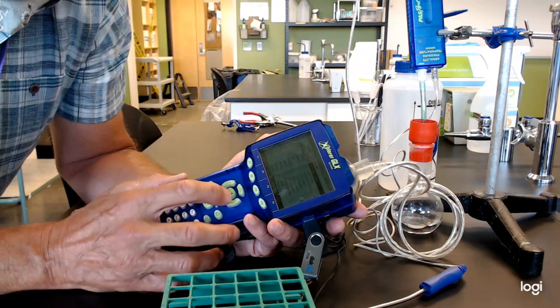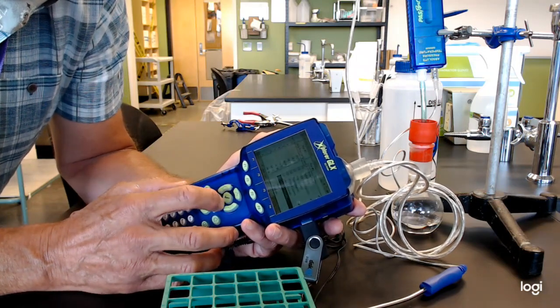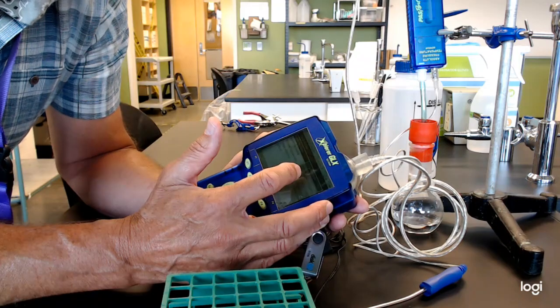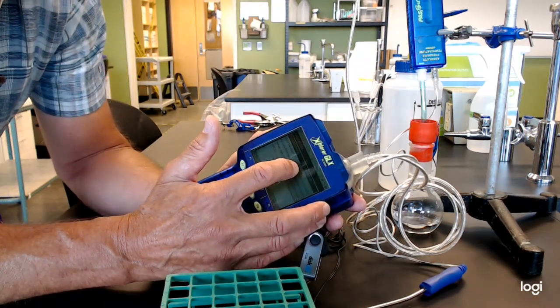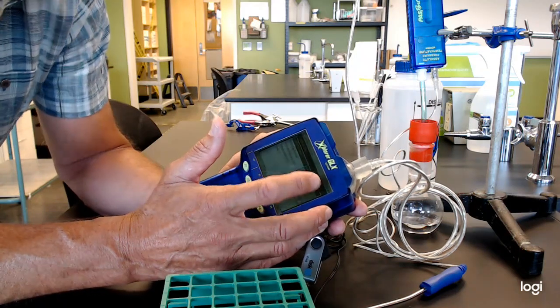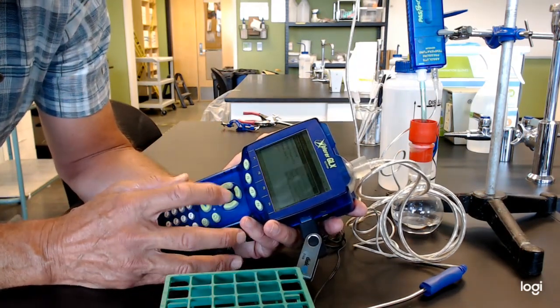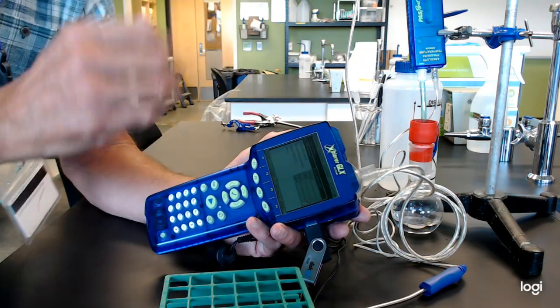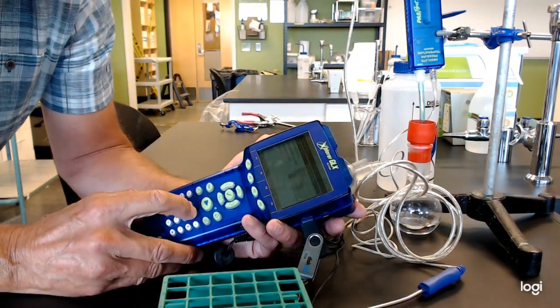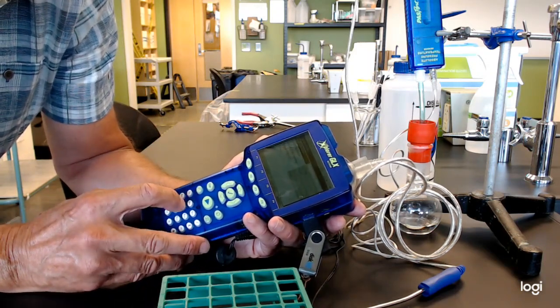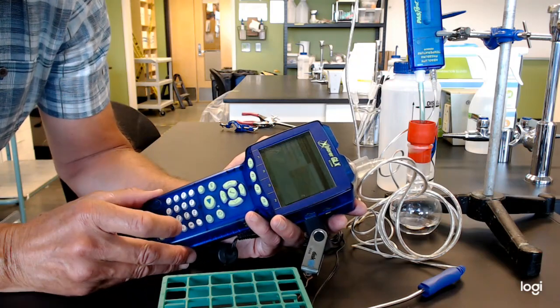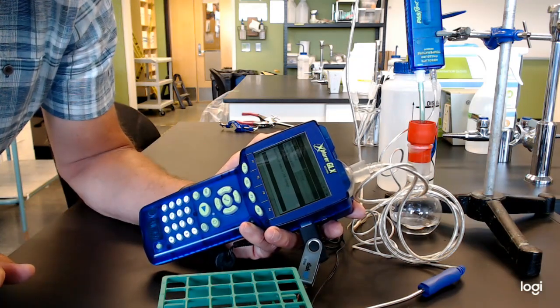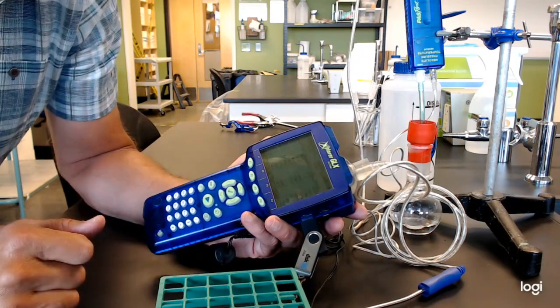So here we go. Export all data. And this is why it's probably worth your time to change the name every once in a while because if you've just been blowing through this, well, it did change. It changed to GLX export run two text. So it did change for me. But sometimes I know when students are using these over and over, the same name shows up on the computer, and that gets really convoluted. So I tend to want to change these, but it's going to be up to you what you want to do. And it is a little different now because everybody's going to have their own data set. So I'm going to export this. Data export's complete.